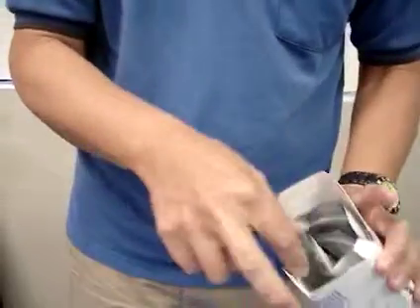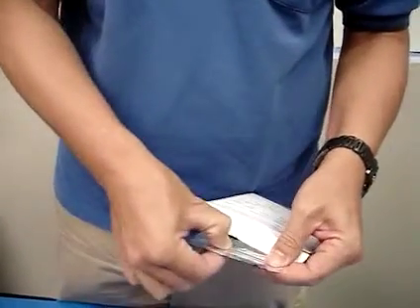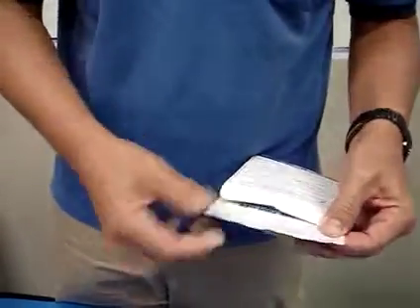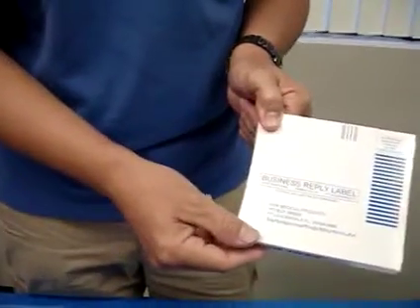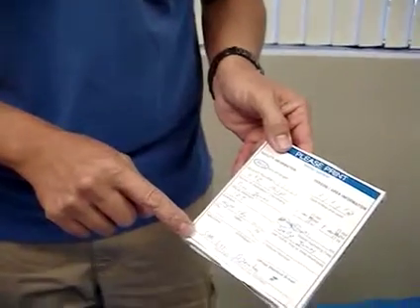At the end of your shift, at the end of the test, we're going to put the badge back inside the 2 foil pouches. Again, make sure that your hands are clean so you don't have any chemical to skew the numbers. That one's zipped shut. This bag is zipped shut. This back in the mailer box. Lock that down. Okay, and then you just put this directly in any mailbox. You don't need a stamp or an address. Just straight in the mailbox. Just make sure that you've recorded some information here.